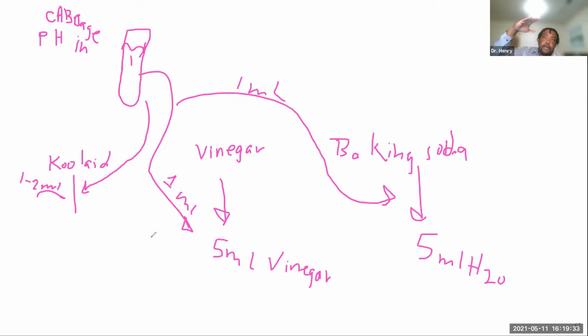Okay, that volume. So if you look at the bottom of the page, it should say volume. Make sure I'm not lying. It'll say V equals K N. And let me give you the value. I did give you the value of K.